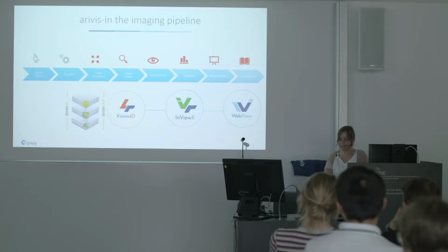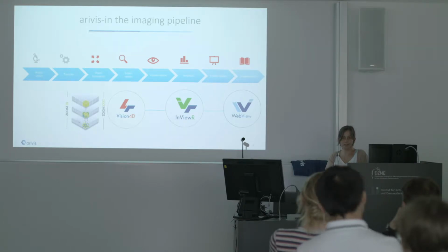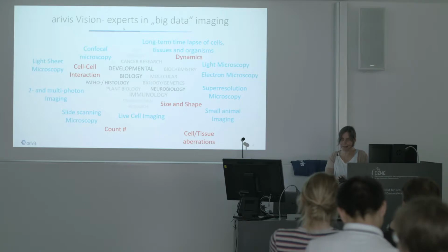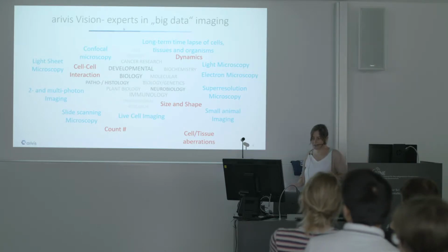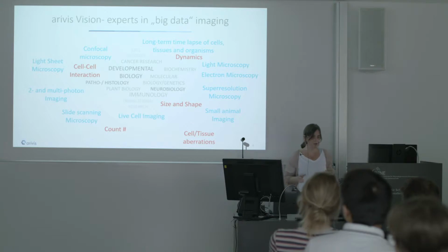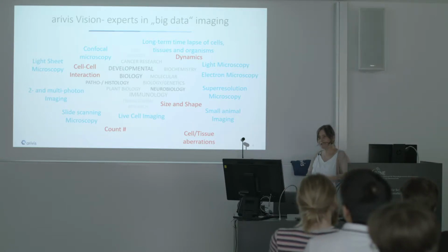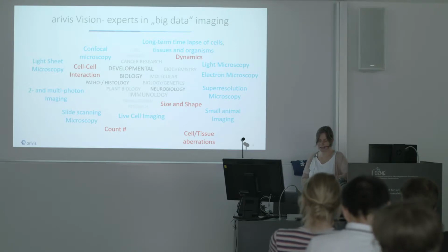Having a dedicated file format, a dedicated file which the software will access in a very fast and robust way. So there's several concepts which make us known to be the experts in handling large image data in the field, some of which we will be able to demo here right now.